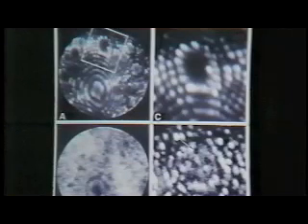Well, you can't do it with field ion microscopy because the field isn't high enough there, right? It's sort of local and it ripples smoothly across the surface. The way that John and I developed is a process called CO field desorption, and it's kind of neat.